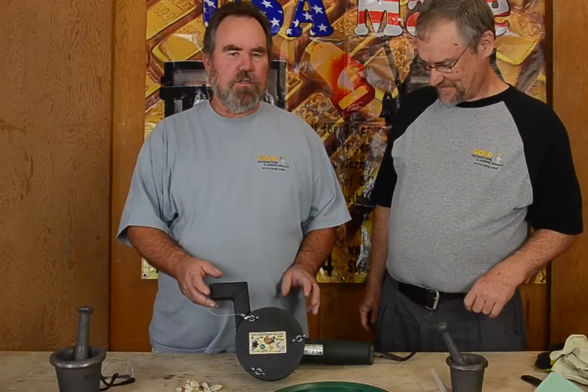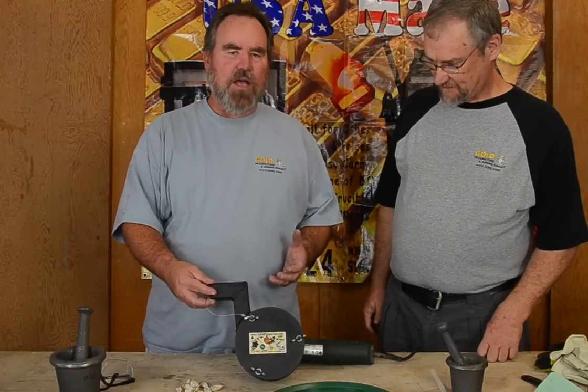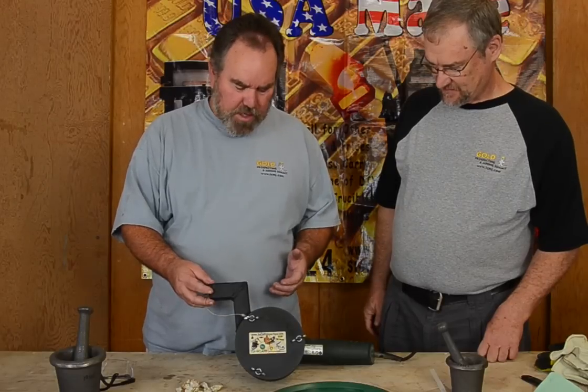What we've got here is a Cobra Crusher. Chris has never used this before, so I'm going to show him how to use it — show you how easy it is and the great results you'll see for yourself.